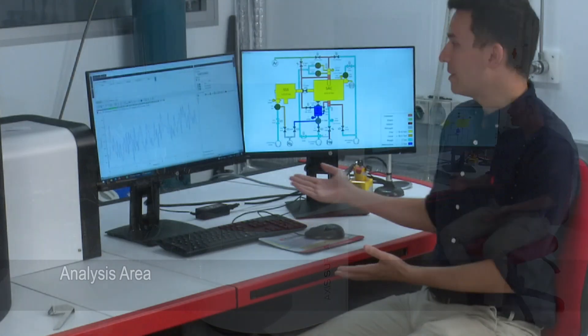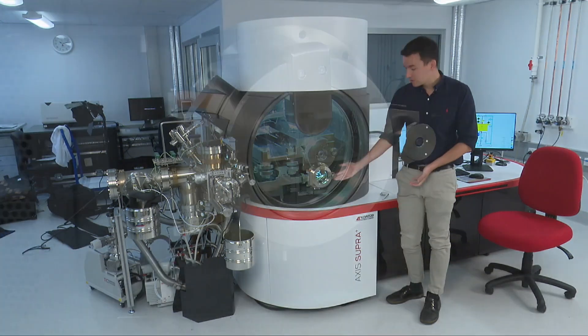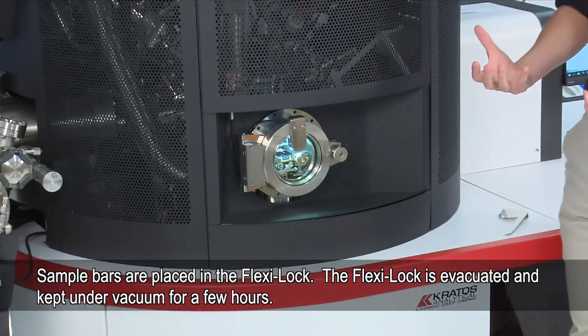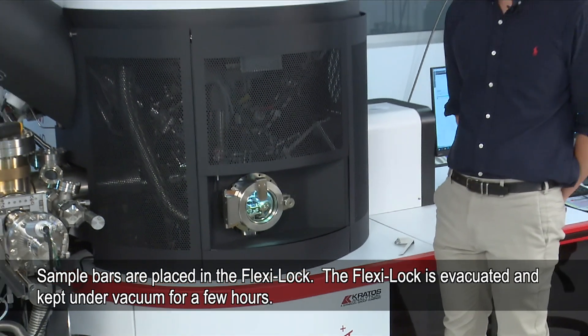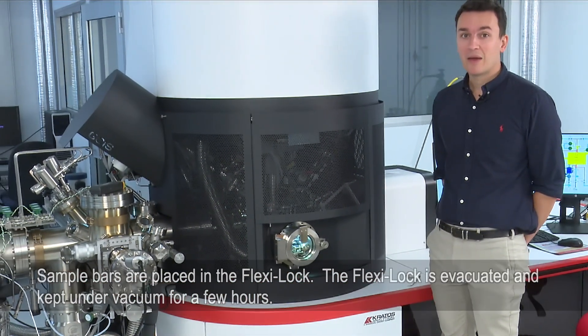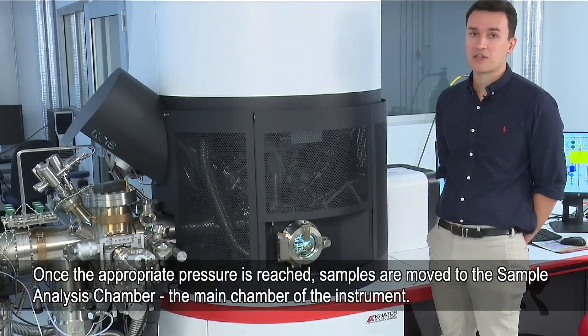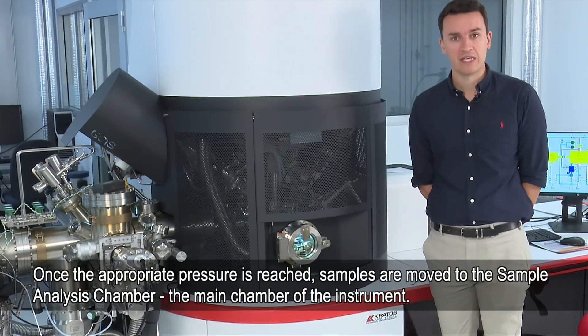As the operator, this is where we do the analysis. This is the Flexi-Lock where we load the samples. The sample bars go into the Flexi-Lock and then they are evacuated, typically overnight or for a few hours, and then once they reach the required pressure, they will go into the sample analysis chamber, which is the main chamber of the instrument.